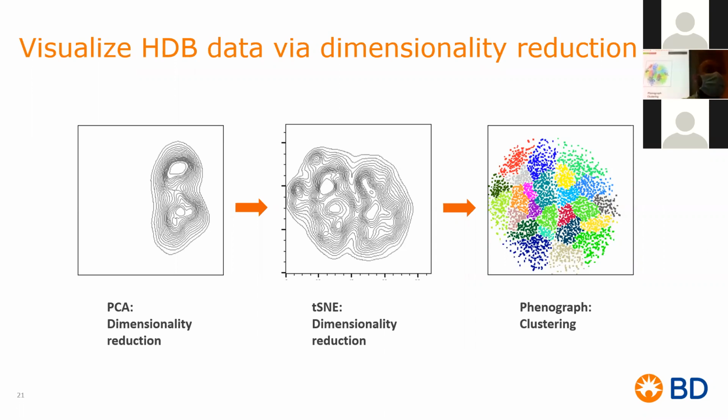But this is what we have to be able to work with, because PCA is going to collapse your dimensions from hundreds or thousands into potentially between 2 and 25. So it's a lot more manageable than by t-SNE. So you generate PCA, and that's my leftmost panel. And then you take those principal components. And again, principal components could be as many as the number of cells you have.